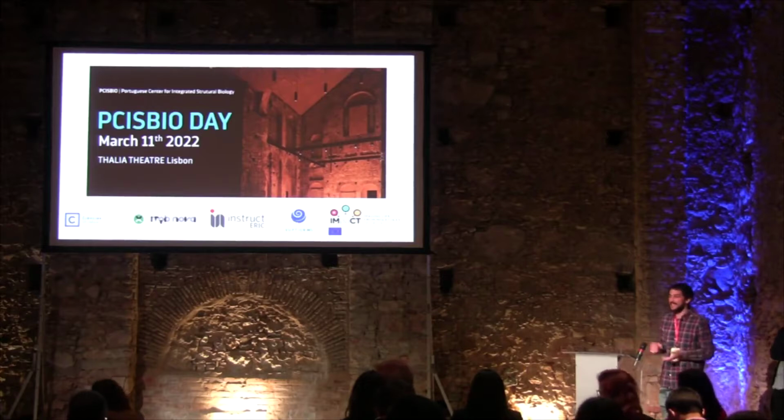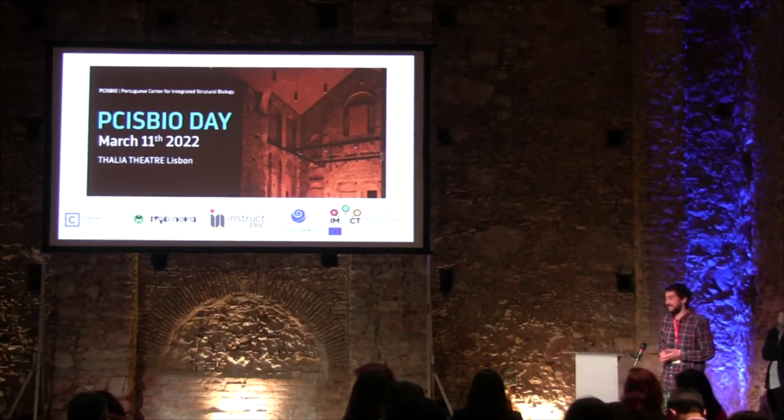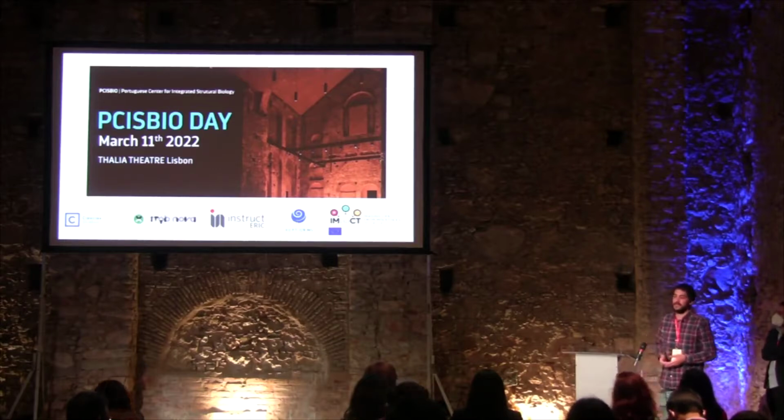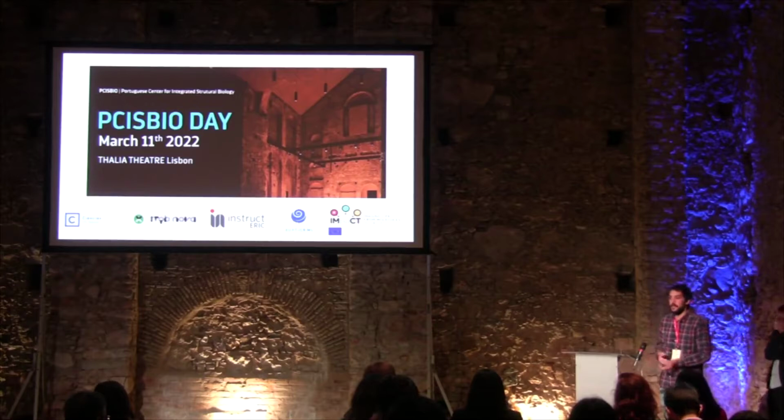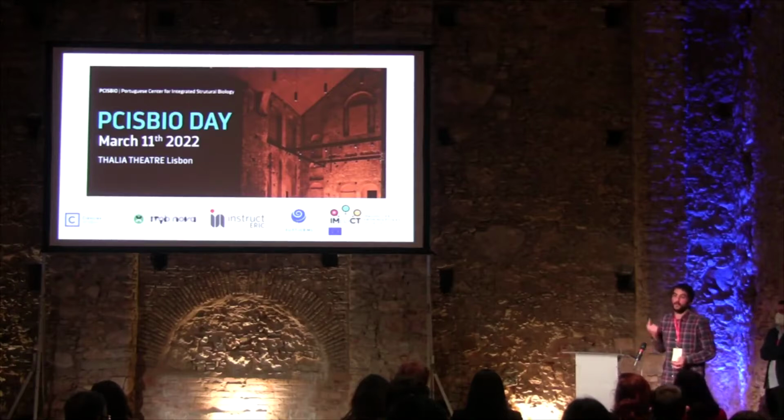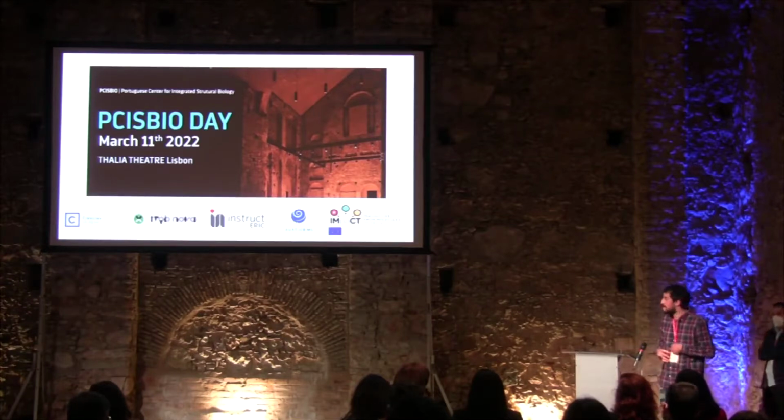That's just the reality of it all, especially if you get access to more data collection sessions. Most of the earlier works on the COVID-19 related stuff involved millions of particles, and you get the structure from that 1% of particles from the whole data set. So I guess it's strength by numbers.